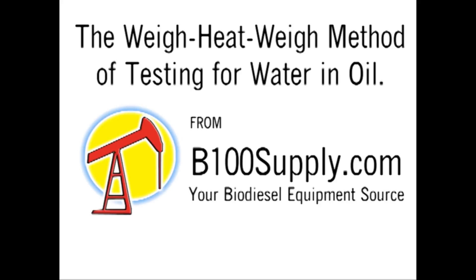As you can see, this is not really accurate enough to measure the water content in finished fuel to ASTM levels. To do that we need to increase the sample size to at least 500 grams, or use a test like the carbide manometer. That finishes this for today — we hope you found this useful, and good day from B100 Supply.